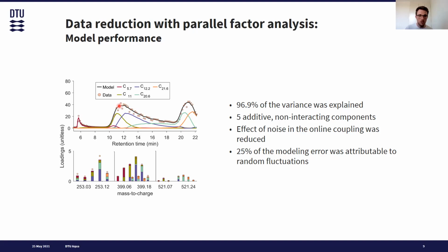and seems to approximate the bulk fairly well. So the other colored lines here represent the individual components and their contributions in the chromatogram. And we can also see at different mass-to-charge ratios, we are representing the patterns in the mass-to-charge ratio spectrum fairly well as well.